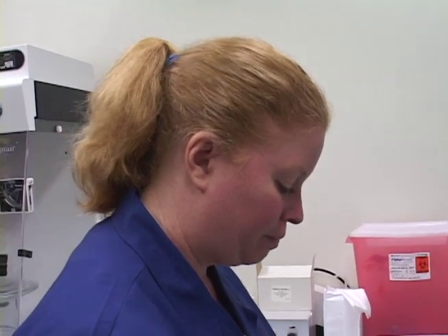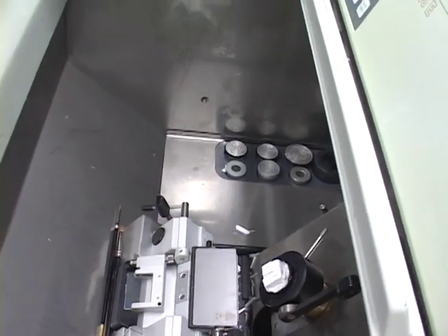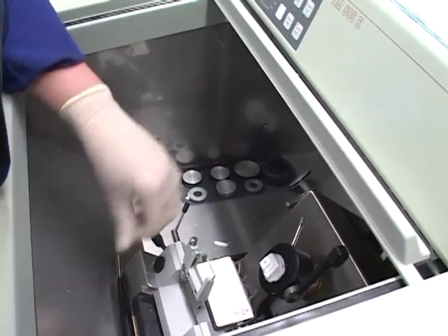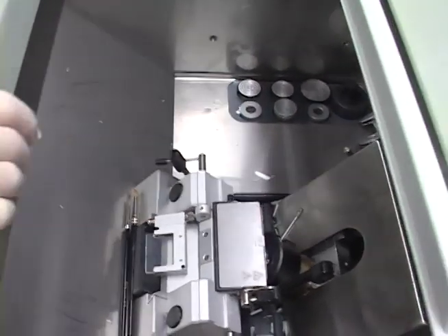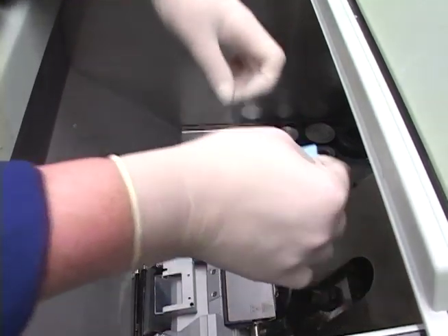Not all cryostats do that, but many do — especially some of the older ones. So we were cutting at 20. I want to make sure it's still aligned. There we go. I'm going to use Monica's slide here.